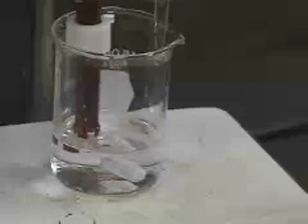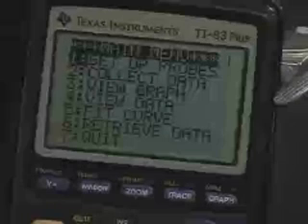We're going to place a calibrated CBL pH electrode into the beaker. We're going to gently stir the solution. We want to be careful that the stir bar does not hit the electrode. We've already calibrated the pH electrode.